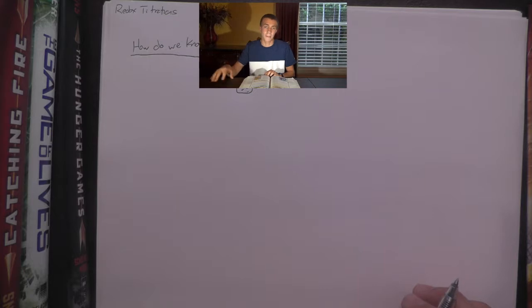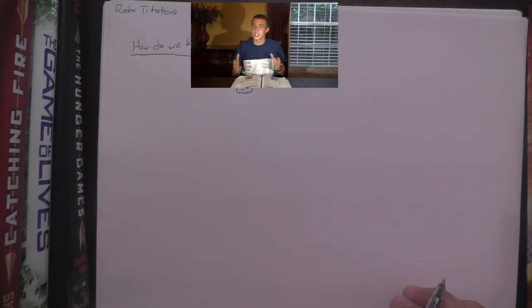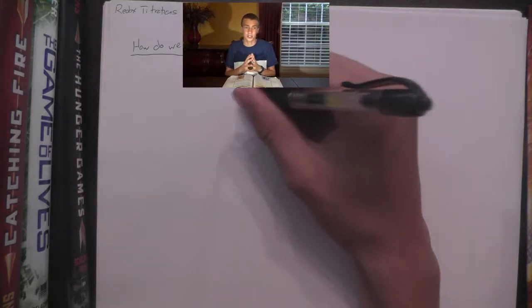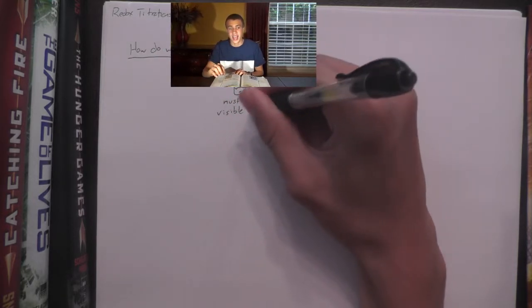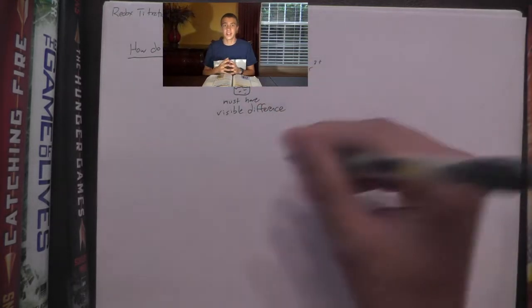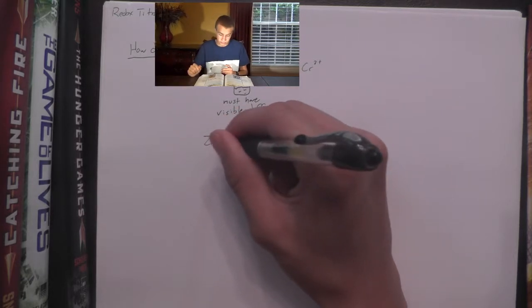versus redox reactions, where you're going to be looking at a reaction that will change one compound into another compound that has a visible difference, which means, unfortunately, not all redox reactions can be titrated. You have to have something, for example, say a solution of zinc that goes into a solution of copper, where you notice a sizable color change from blue to clear, or something of that ilk, so that you can actually see when your reaction has gone through to completion.